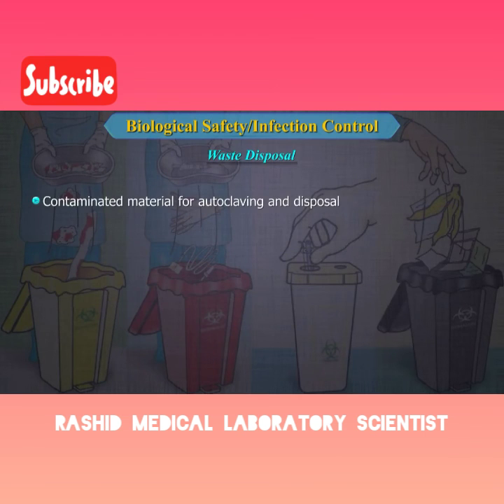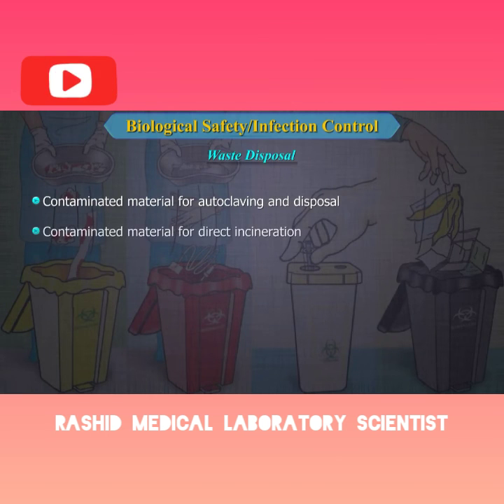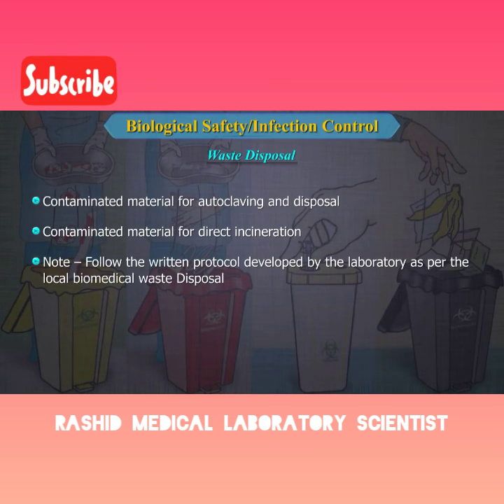3. Contaminated material for autoclaving and disposal. 4. Contaminated material for direct incineration. Please note that we must follow the written protocol developed by the laboratory as per the local biomedical waste disposal.